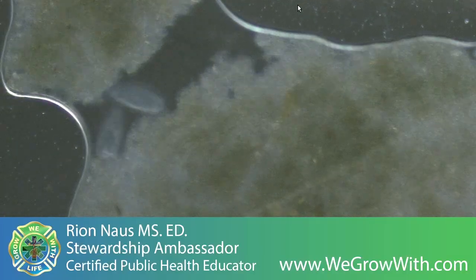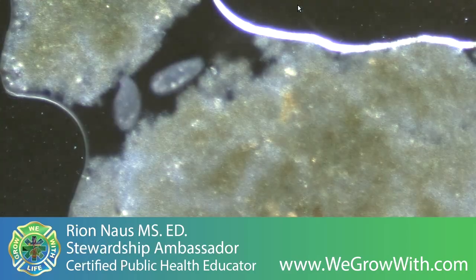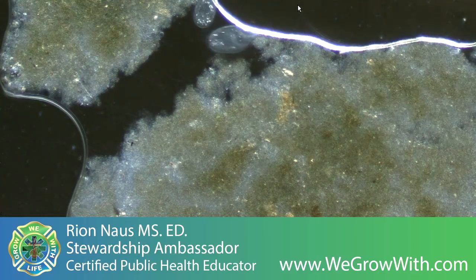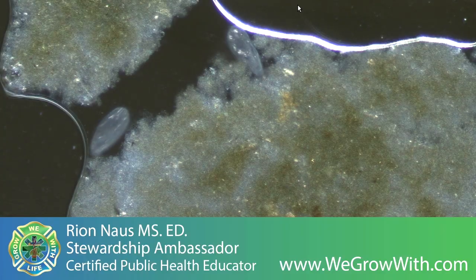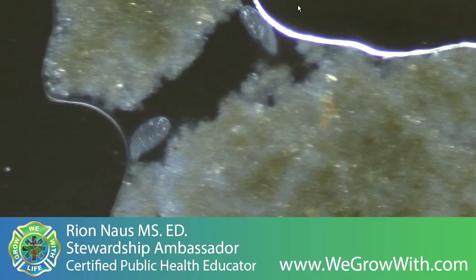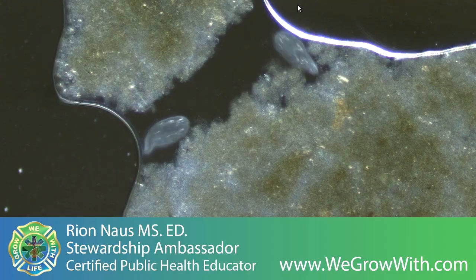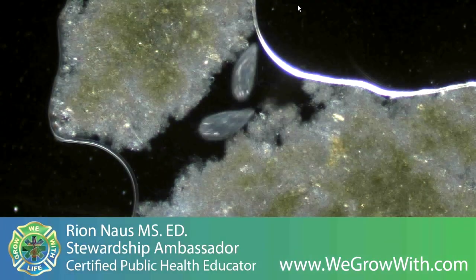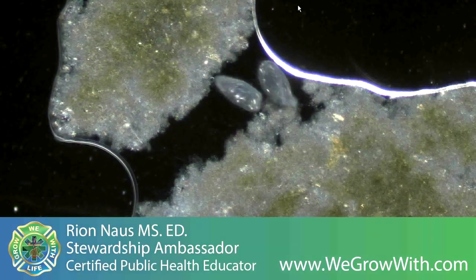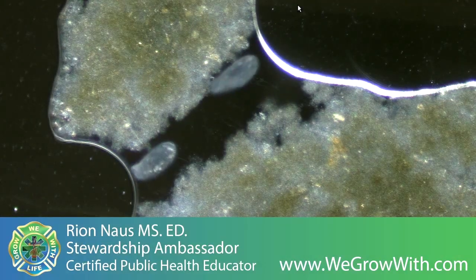And when that happens, things tend to glow. So you can actually see inside of those ciliates different things that they've consumed, refracting the light differently.